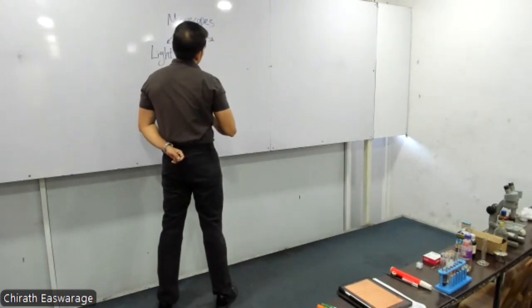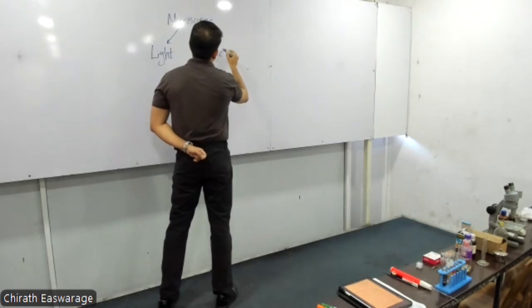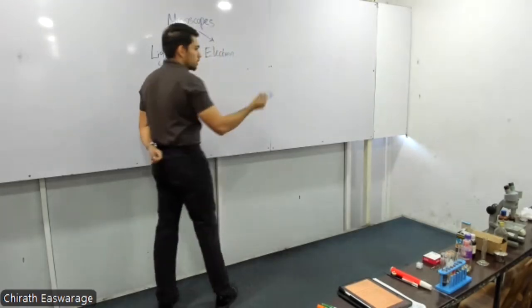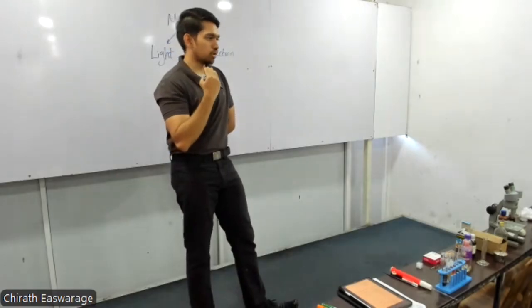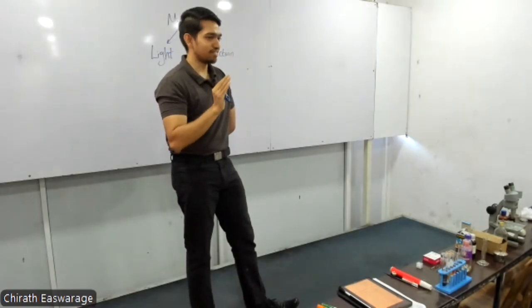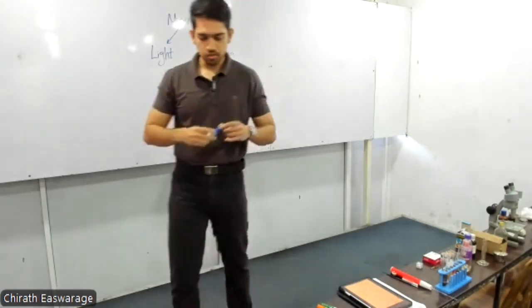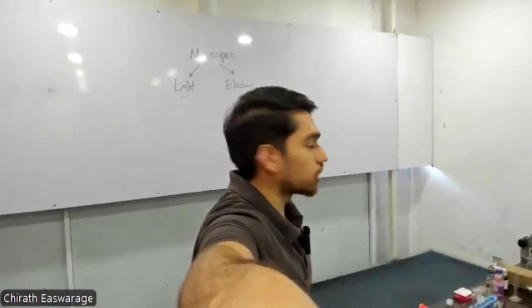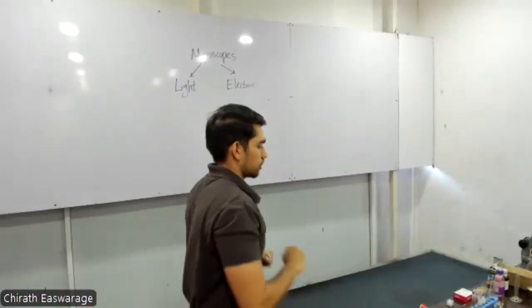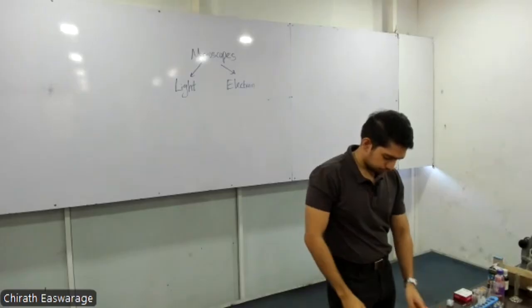Then with technology, we have developed another type of microscope, the electron microscope. We use a beam of electrons that is going to be reflected off something and going to come to your eye. No, sorry, not to the eye. We can't see electrons. It's going to be detected by a special sensor. Those are electron microscopes that are connected to a computer. Okay, the image is made by the computer. I'll show you some electron micrograph images as well.